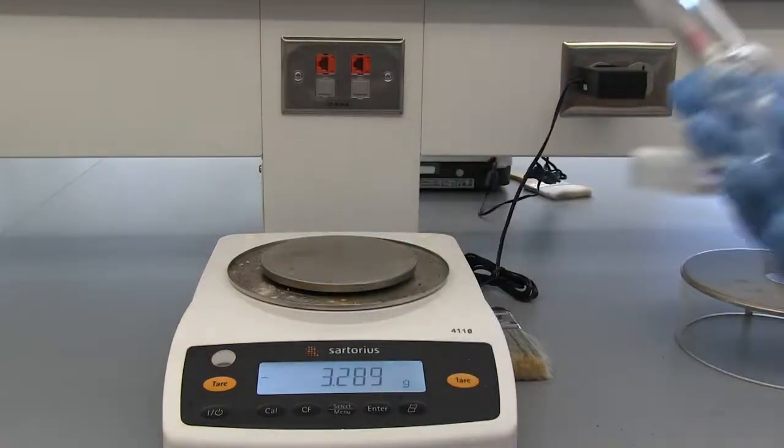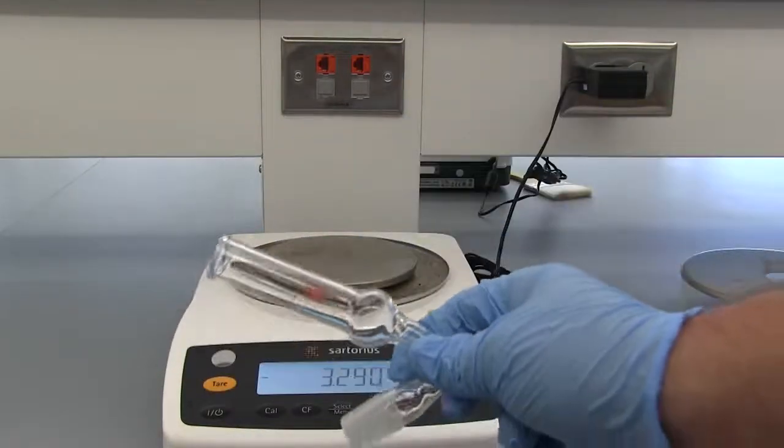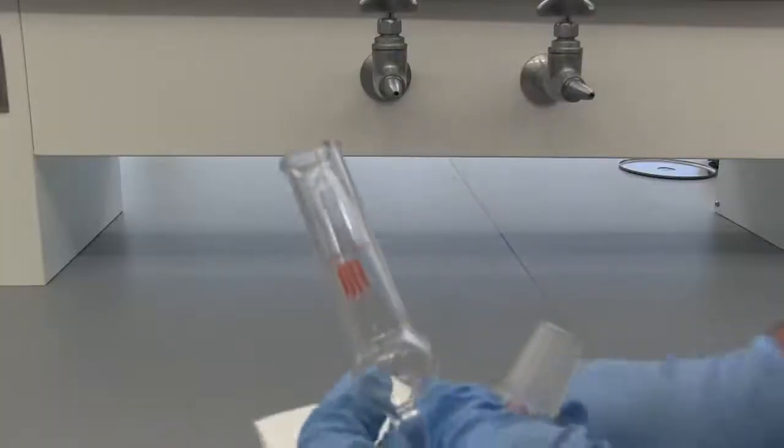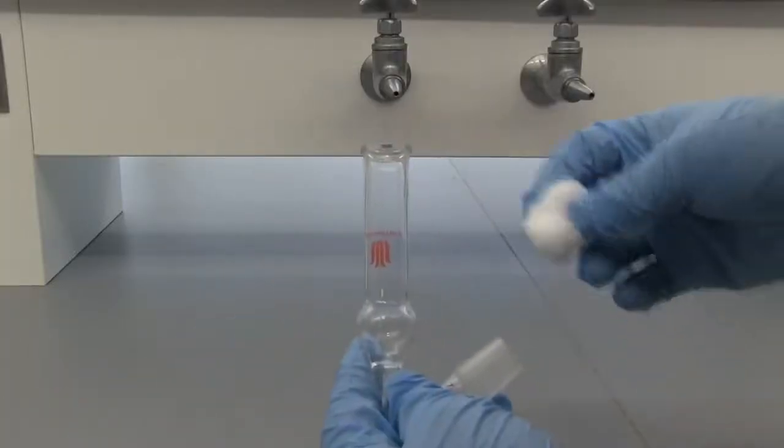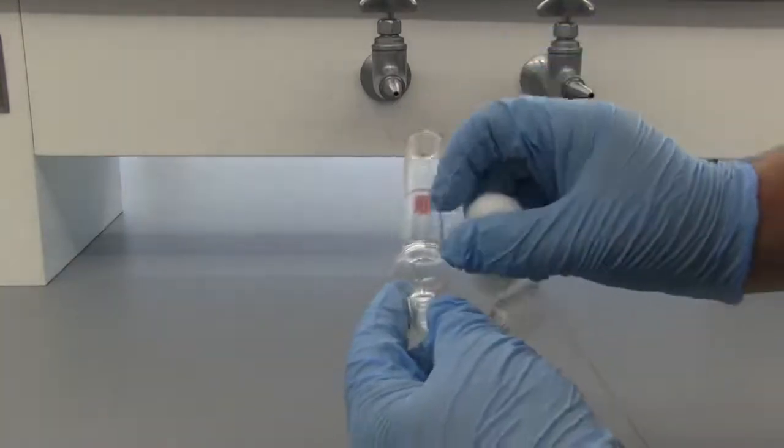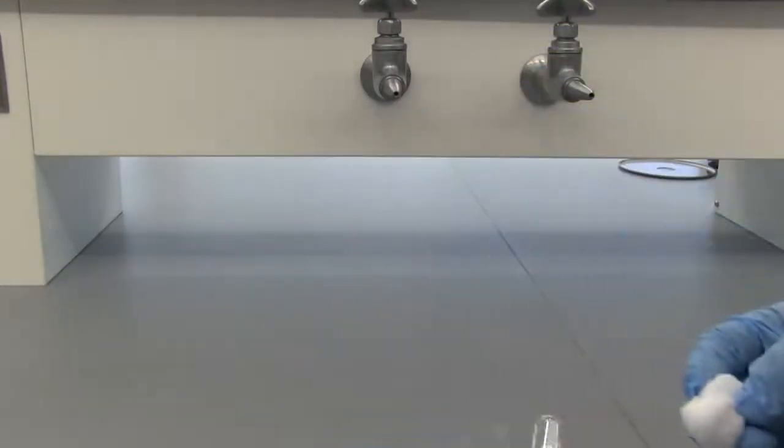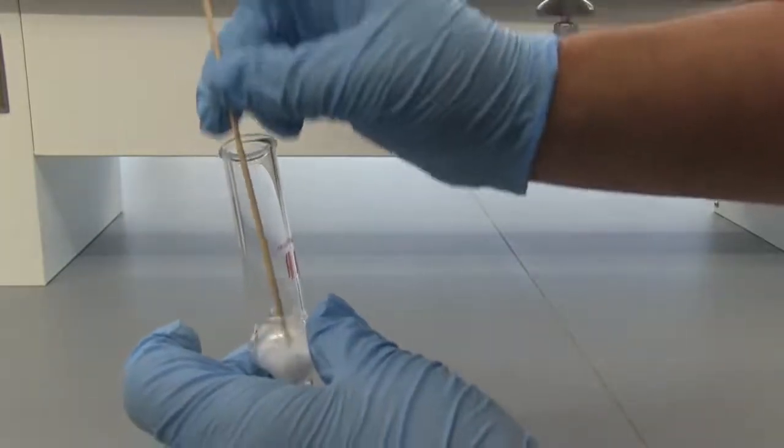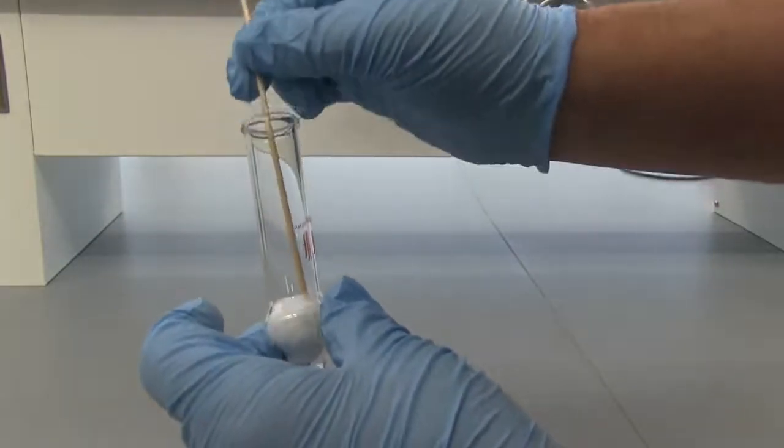All right, next we're going to add our diethyl ether. But first we want to go ahead and prepare our drying tubes so that we can put it straight on after we get the diethyl ether in there. All right, so preparing our drying tube, we're going to need some cotton at the bottom, cotton at the top, and we're going to fill with calcium chloride in between. So go ahead and tear a decent-sized piece of cotton. So we've got the cotton in there. I'm going to use a wood applicator stick to just help push it down.